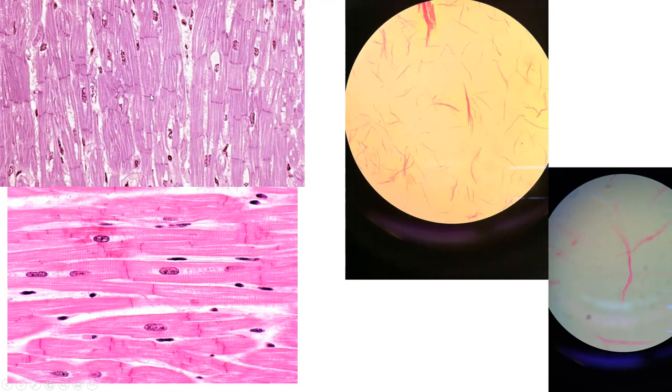This is cardiac muscle. You should also be able to see striations, which you can see right here. But the big thing about cardiac muscle is you also get these things called intercalated discs. These are a combination of gap junctions and desmosomes that allow the cells to rapidly communicate with each other. So, intercalated disc, intercalated disc.